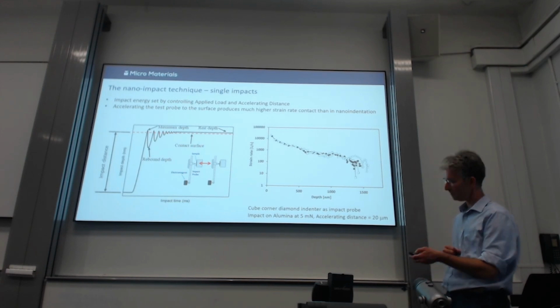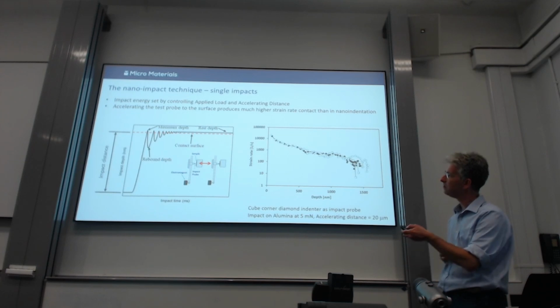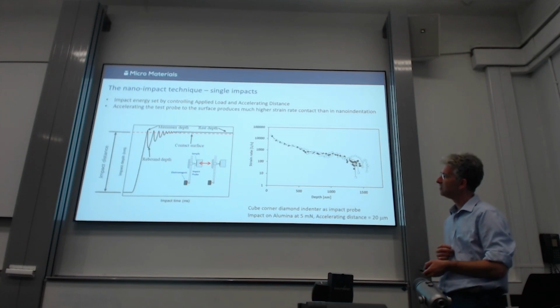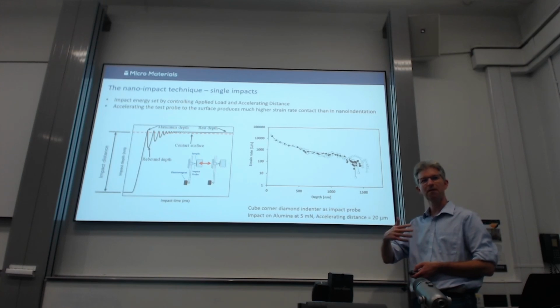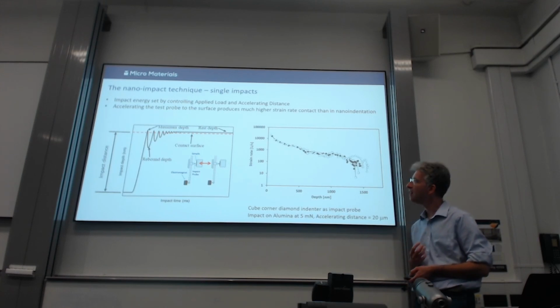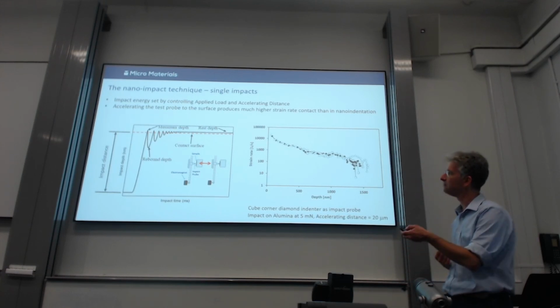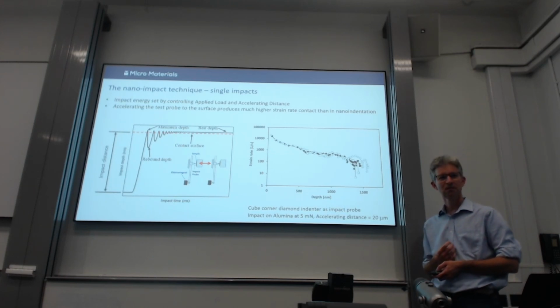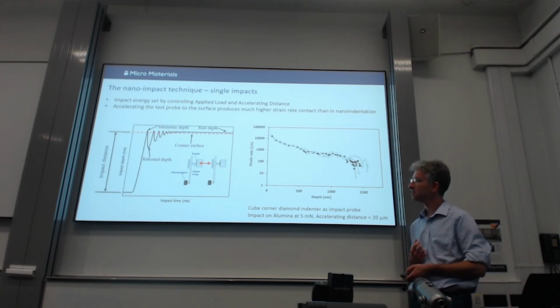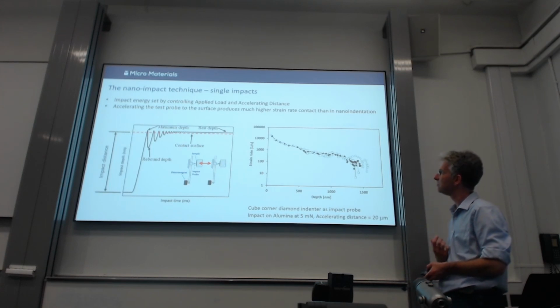So we talk typically about setting the accelerating distance and the applied load. And the reason why those two things matter is because in impact, unlike indentation, we're thinking, instead of force, we're thinking actually it's the energy that controls, sort of approximately a force times distance relation. The energy that controls what goes on.